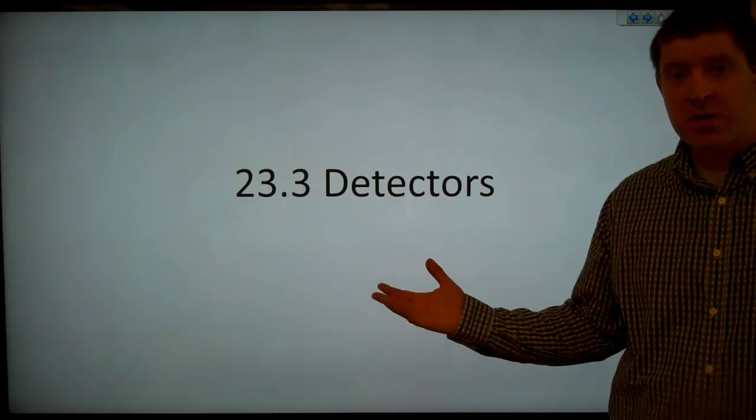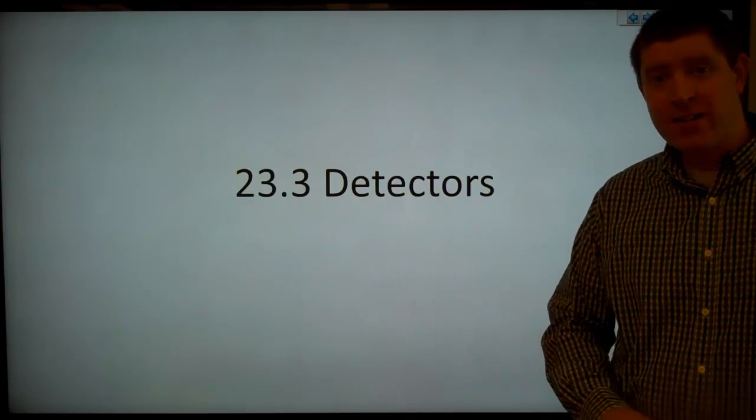Welcome to Detectors. Here we're going to talk about the detectors used in gas chromatography.